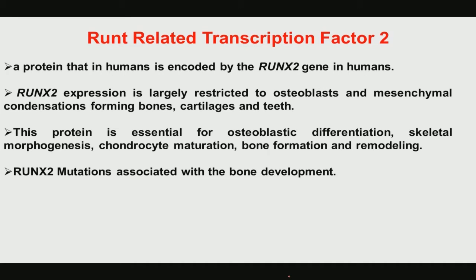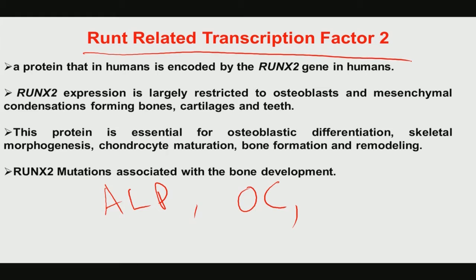So far I have done ALP, then osteocalcin, and this is the third one, the Runt related transcription factor 2, or in brief RUNX2.